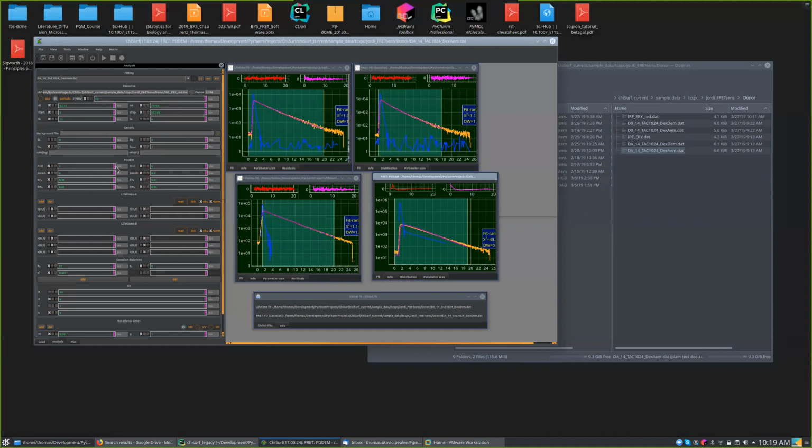Okay, but the question is how could you determine this? Now it's fixed, right? So pure B and pure A are fixed, but is it actually a fraction of donor only in the decay, or acceptor only? How would you like to determine this? I mean, these are fixed parameters. Shouldn't they be fitted? Yeah, they should be free later. Now they're just fixed for the start.